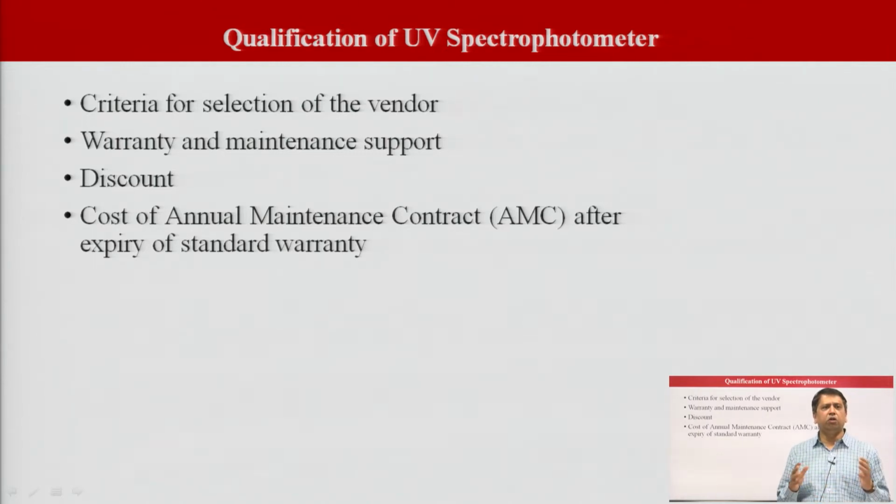So, these are all the things that should be taken into consideration before the procurement of a UV visible spectrophotometer, and the documents about all these things are considered as the design qualification of the UV spectrophotometer.